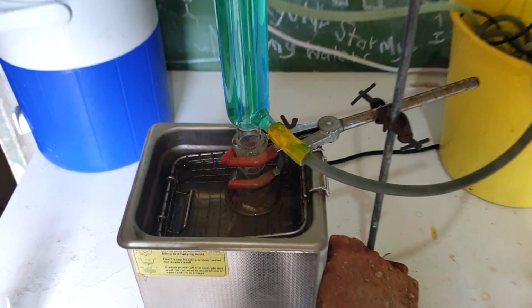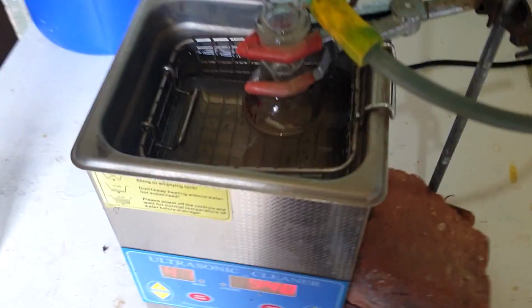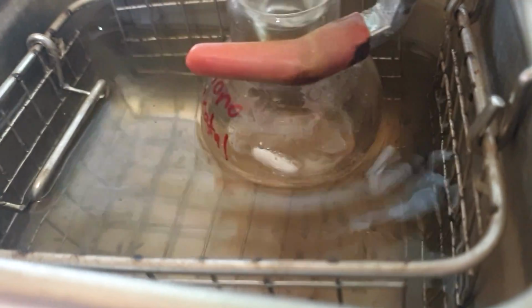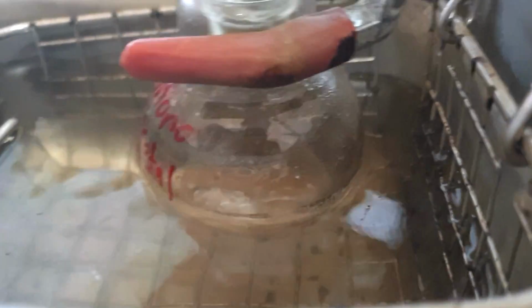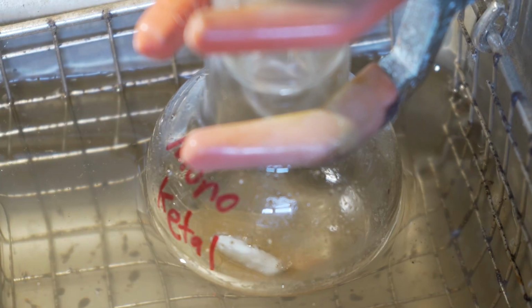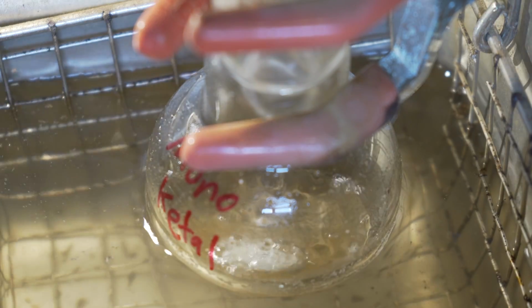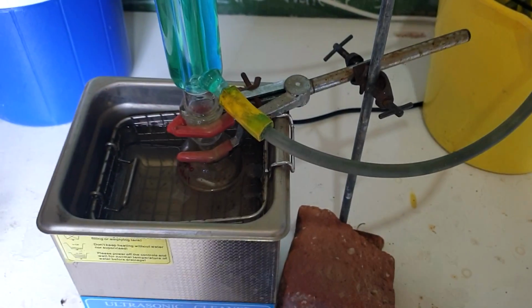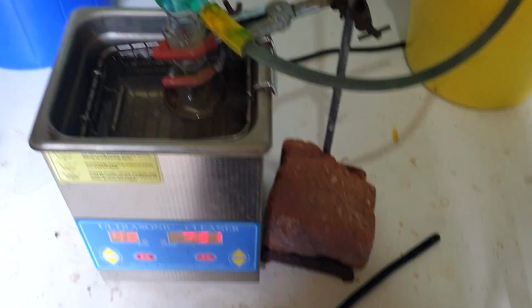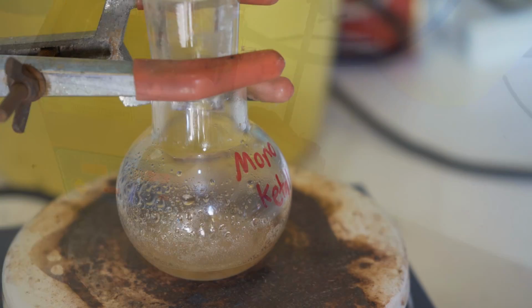Alright, I'm going to give up on this bath. I think it's very good for suspending particles in a liquid, but it's not very good at mixing these two biphasic mixtures. You can see that bottom layer there. I turn it on, it boils more. The mixtures really aren't stirring together. Also, the sound is horrendous, sorry. Sorry if I had to mute that in post, but the mixture isn't really mixing together, so I'm just going to go back to the ye olde hot plate and stir it, because I've got to stop overthinking it. Fast and loose, we're trying to do fast and loose, so I've got to stop overthinking this.